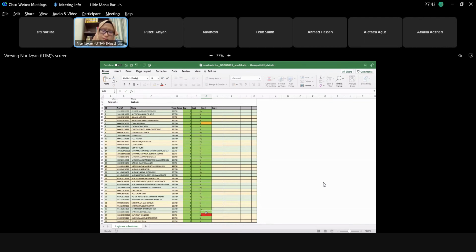Siti Zakia. Yes, doctor. Okay, ppm stands for? Concentration. Yes, it is a concentration, but ppm stands for parts per million. Thank you. My last question goes to Nurina Batrisha. Yes, doctor. Later on, Dr. Faizwan will prepare a working solution of how many ppm?